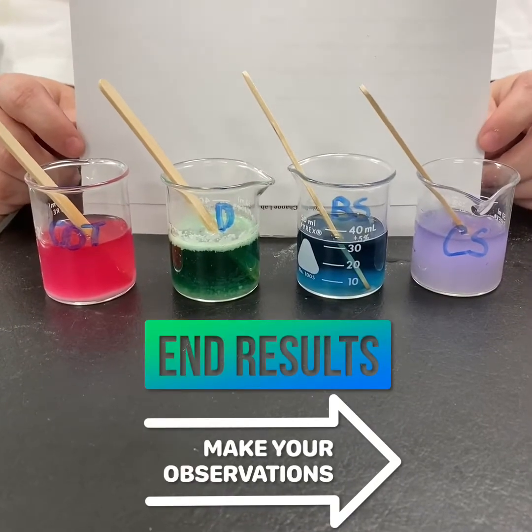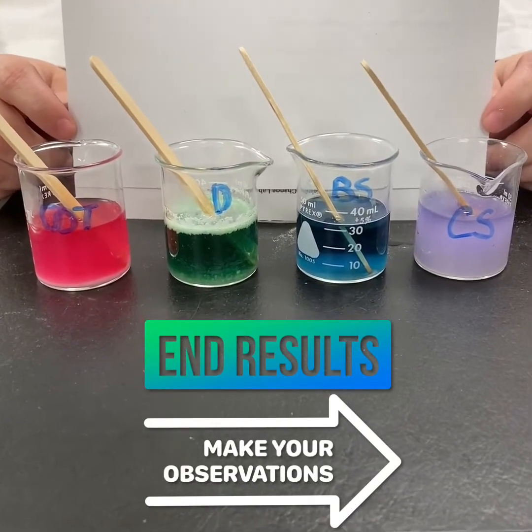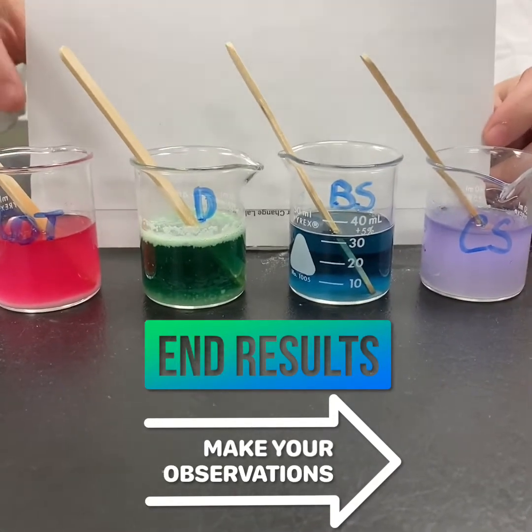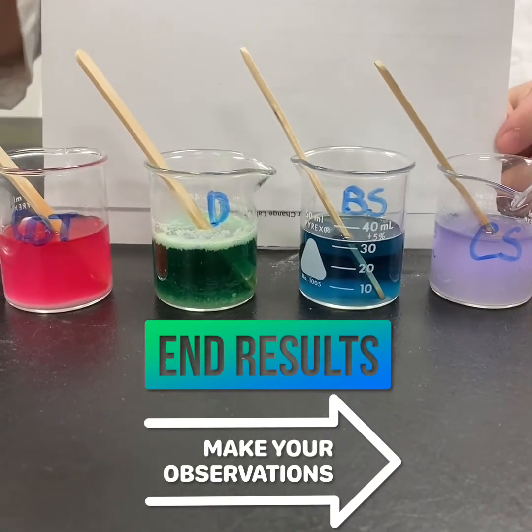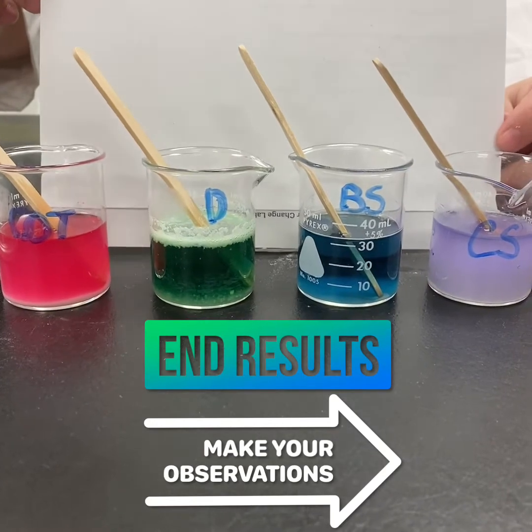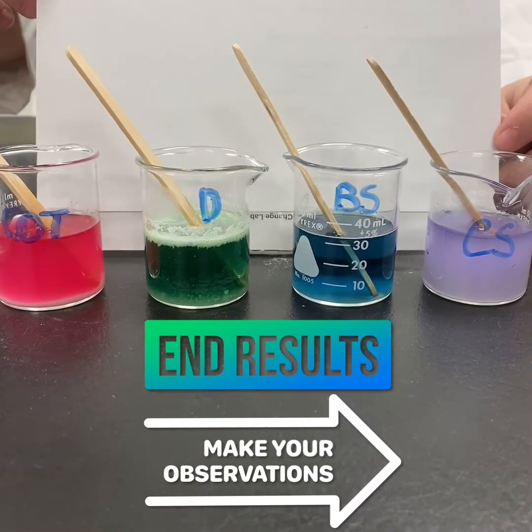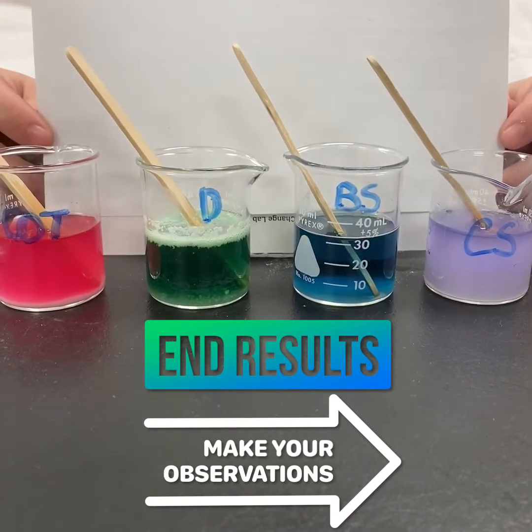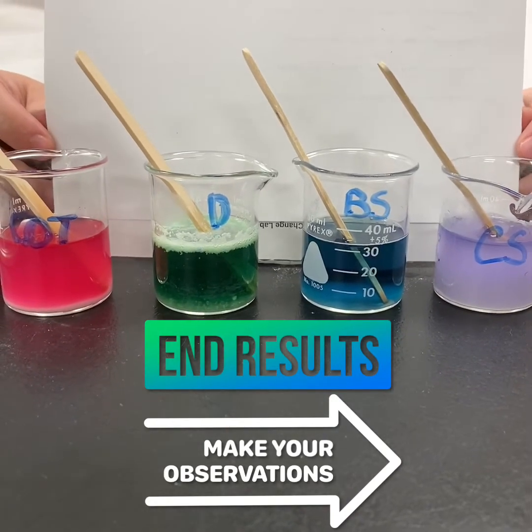These are our finished substances mixed in with our indicator solution. Our cream of tartar, this nice bright pink, the detergent, the green, the baking soda, the blue, and the cornstarch, the purple. Make sure you are making your observations as we do this lab.